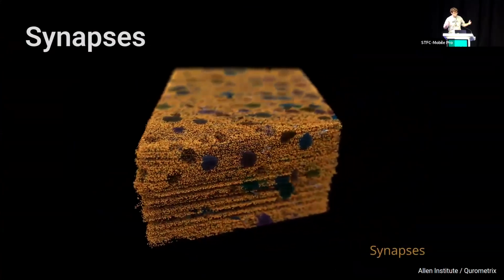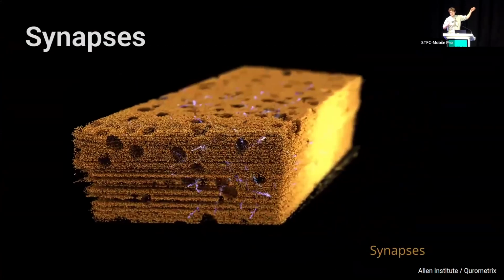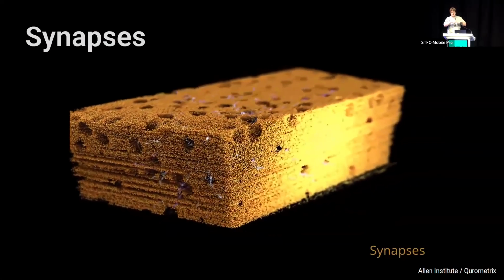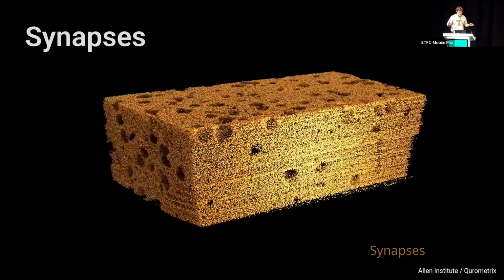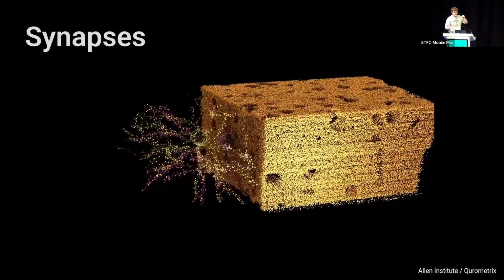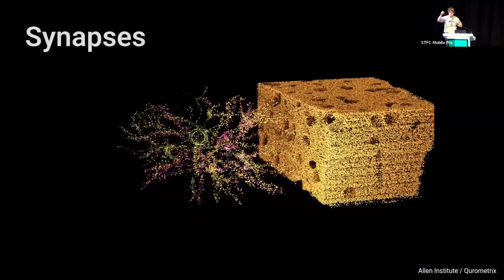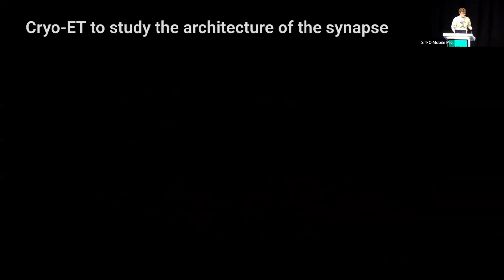And you get this really rich data where you can annotate all these neurons, and all these yellow dots are synapses, right? Places where one neuron talks to another. And that's essentially how we think. And I don't think anybody here would fight me on this when I say that in order to really understand it, we need to image each one of these yellow dots, and really understand how our molecules are organized, where the receptors are, where neurotransmitter is being released. And so what would be really great is to image these synapses with cryo-EM, right?